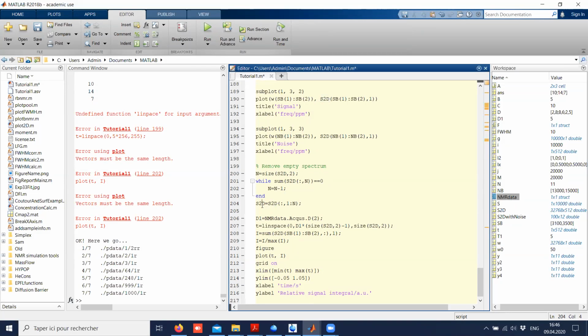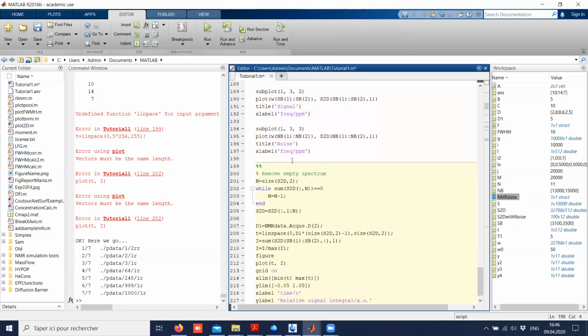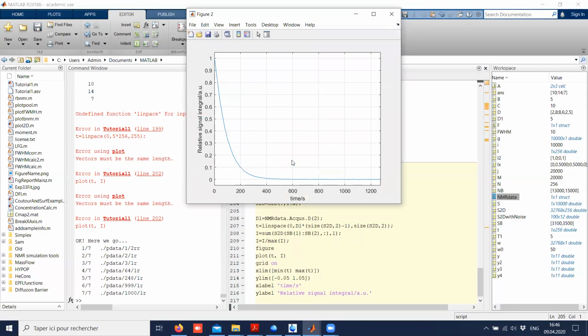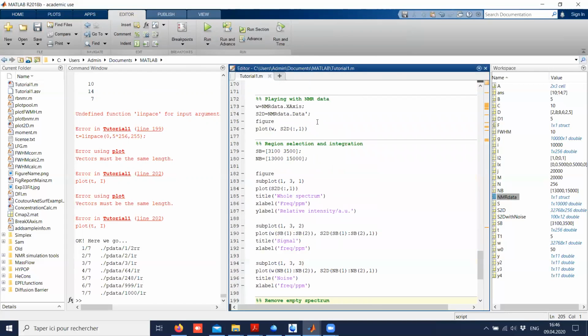Now you replace this by all the lines and columns 1 to n. So that's what it does, it replaces it like this. Let me show you again.